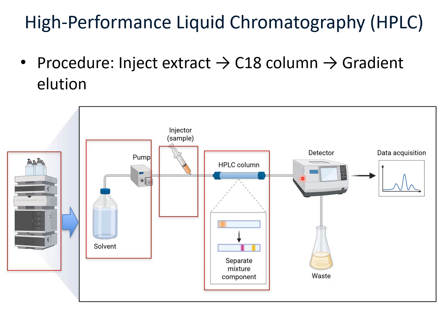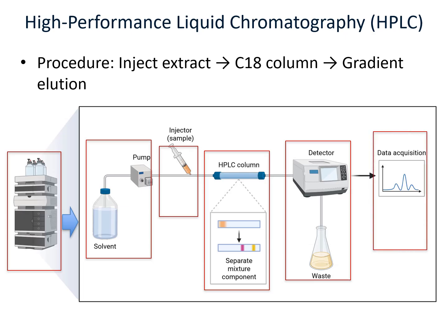As they are passing, they are passed through a detector that will now detect the components and send the information into a computer software, the HPLC software, which will now produce the response for each of the separate components in form of various peaks.